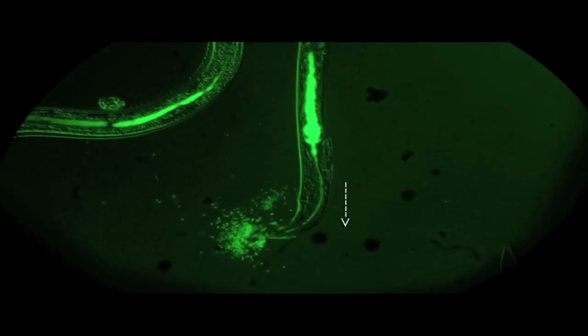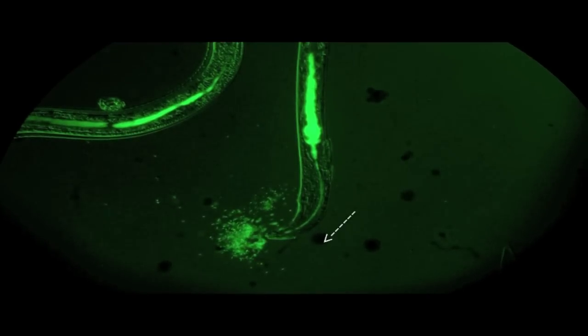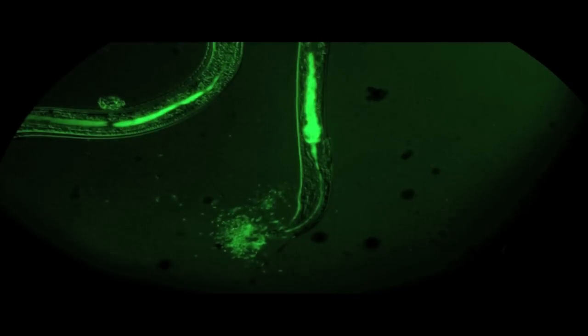Each one of these green dots is actually an individual bacterium. And this video is in real time, not sped up at all. Enjoy!